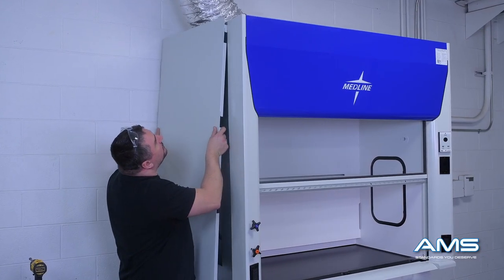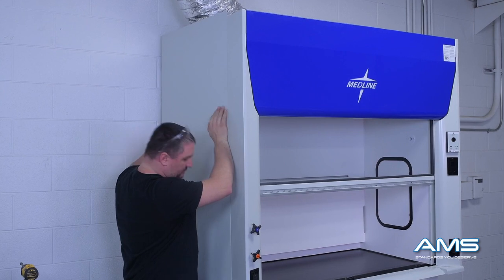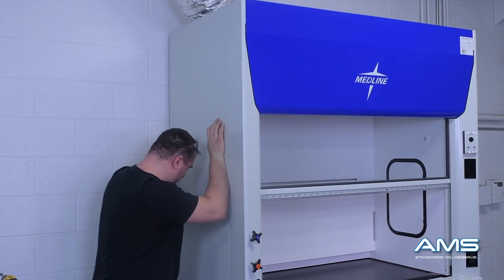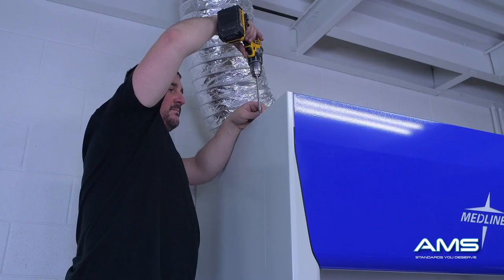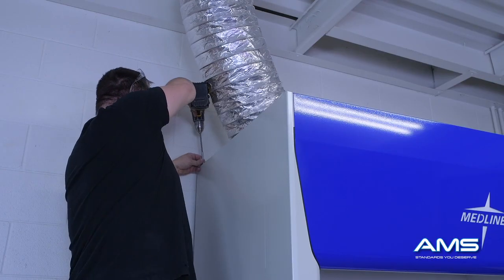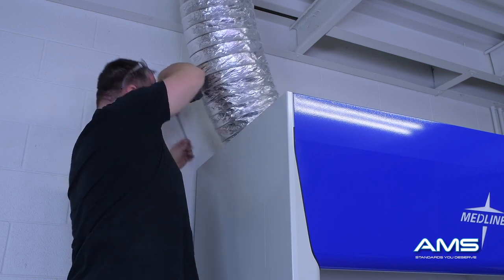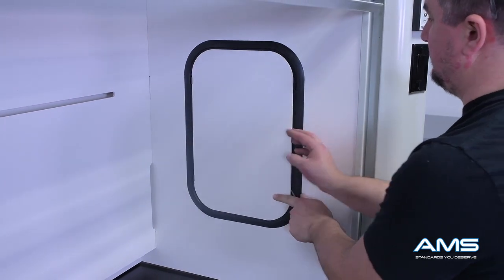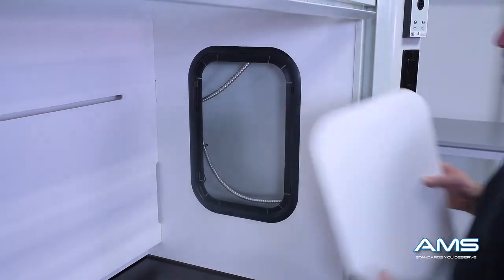Now put the side panels back on: raise them up high and slide them downward until they are in the locking position, repeating on both sides. Take the screws provided and put them back into position on the panels. Then take a flat screwdriver and open the access panels on the interior of the fume hood — you will need these open to attach the fume hood to the countertop.